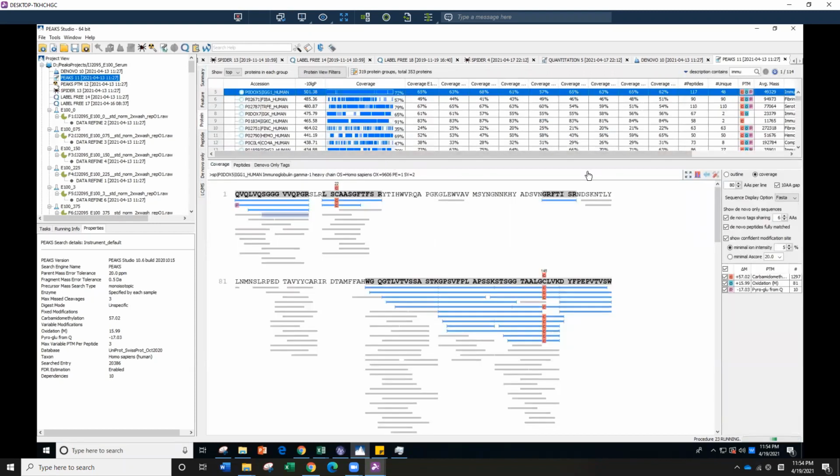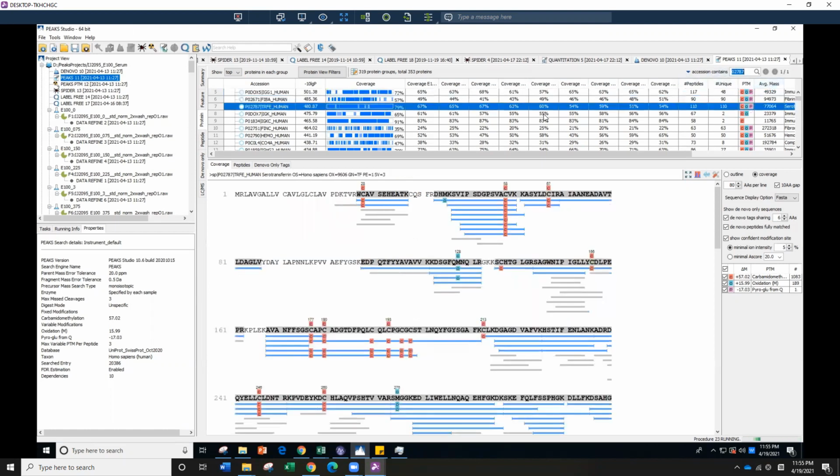For this particular experiment, I like to see my transferrin, and I have been working with it a lot. I know the protein accession number. Search for it, and it will bring it up for you. There's so much data. What are you going to learn, and how are you going to learn it? That is why the objective of your project is important for each experiment, because that guides you to know what you're going to learn.